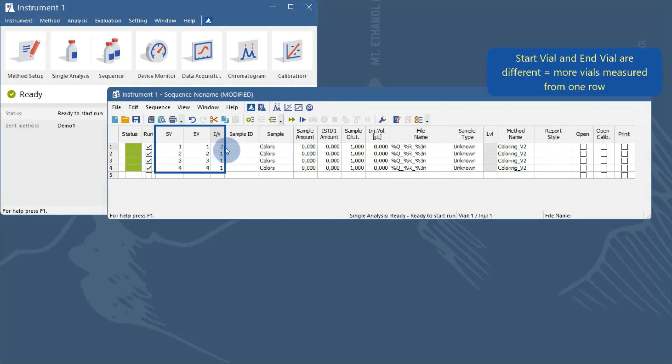In the fourth row, I want to measure samples from vials 4 to 7. So, we change the end vial number to 7.